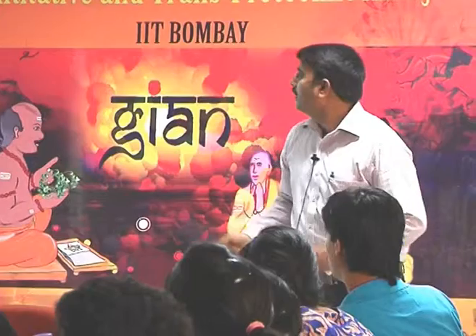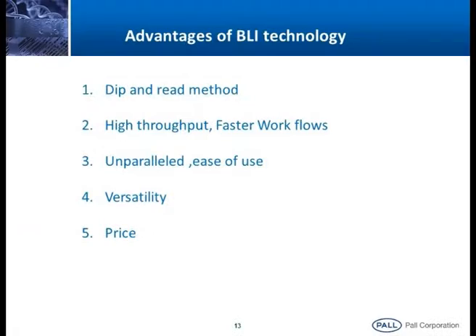So the advantage of biolayer interferometry is that it works on the dip and read format. In a 96 well plate we have put antigen, antibody and all that. The sensor moves like this and we can read. And the advantage is that there are no microfluidic devices.